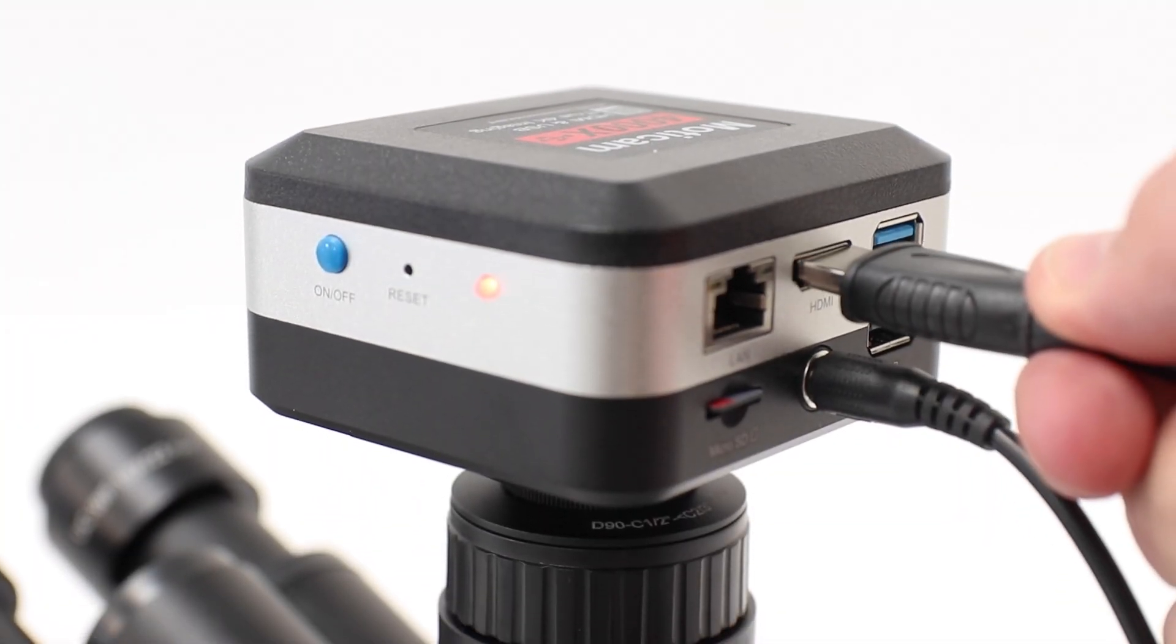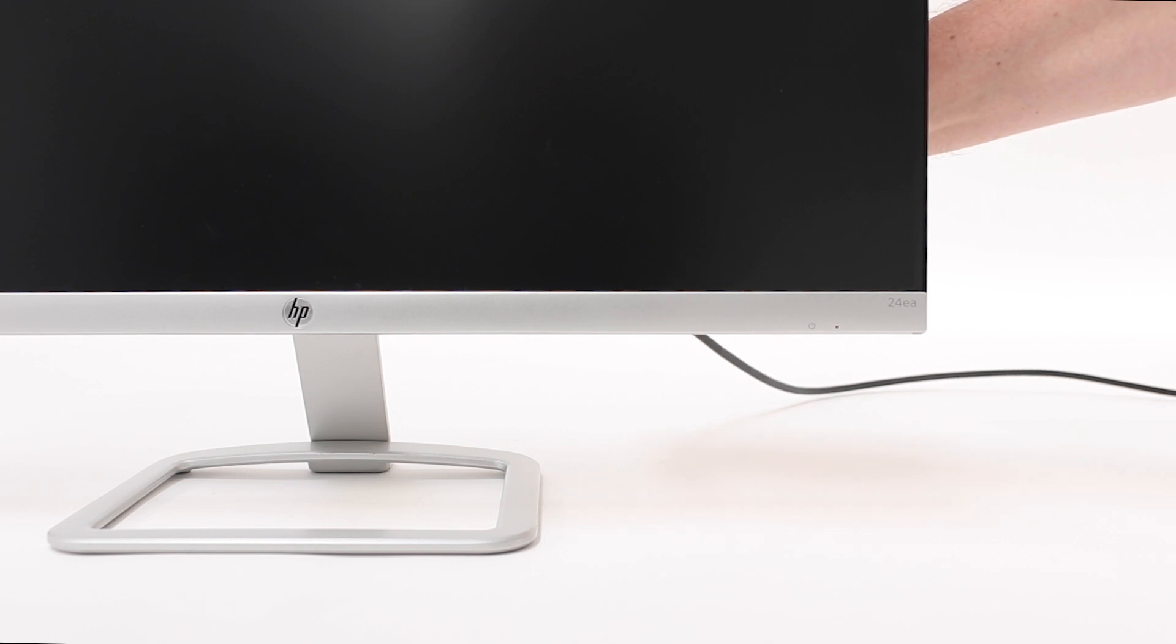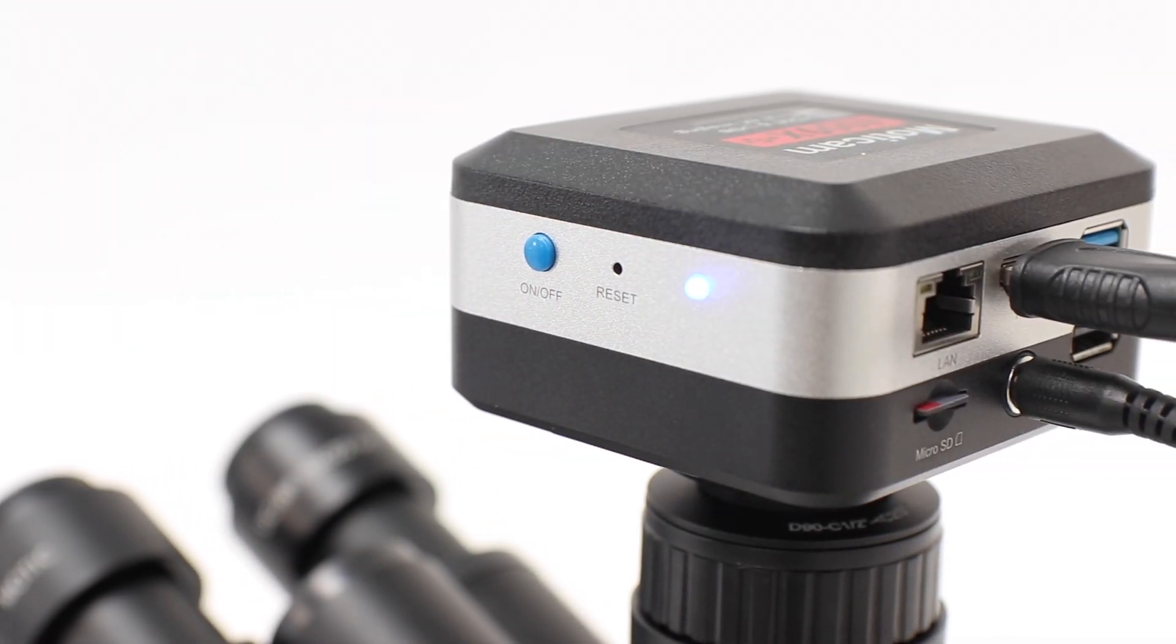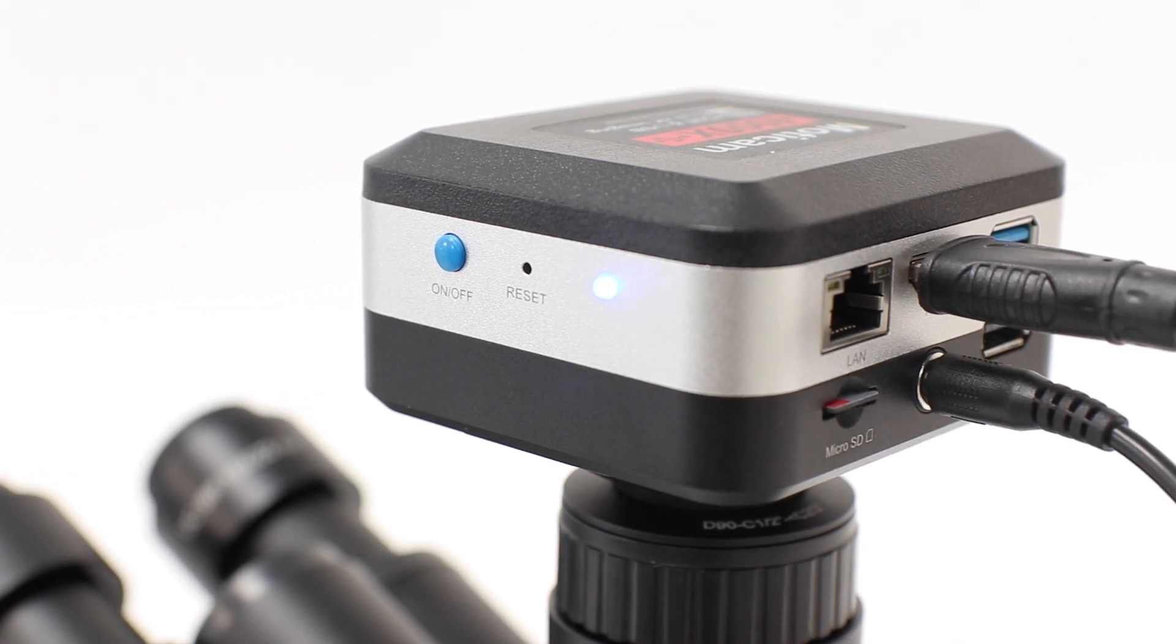Connect the camera to an external device, like a monitor or computer, and power on the camera to view the live image. Keep in mind that connection options may vary depending on your camera model.